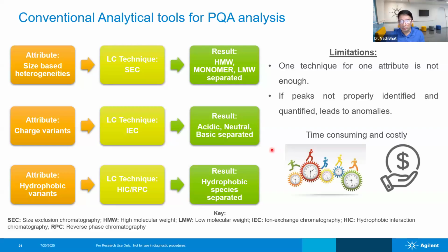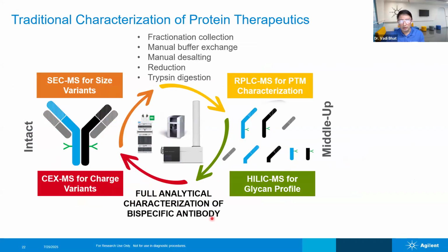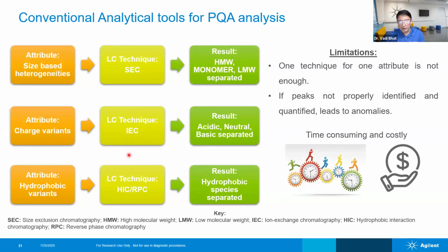And now, to reduce all these burdens, one can actually go for this, just showing schematically how you are doing that. And of course, if you add mass spectrometry, you still have to go through the same kind of separation. Generally, you are doing all this analysis by UV detector, or some other detector, fluorescence, or other non-mass spectrometer based detectors.